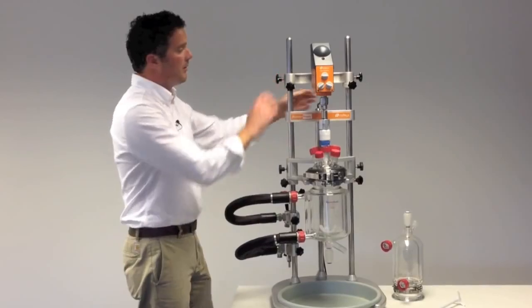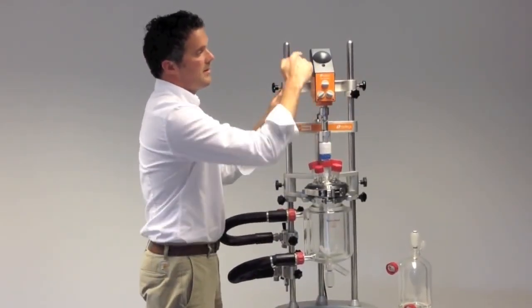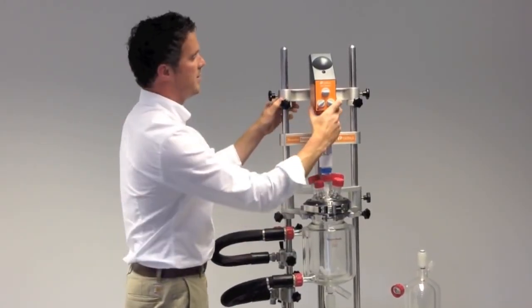At the top of the framework is the I-beam supporting the overhead stirrer. This is Radleys overhead stirrer, but they'll accept most major overhead stirrers.